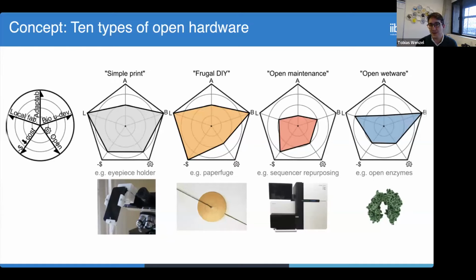And I don't know, maybe in other places you don't have these electricity spikes, but you might not consider that in your design, or we have earthquakes, so things fall down. So let's just say you make a design and then we want to use it, but really we need to make some modifications to it so that it works well for us. So how adaptable is the design? I think that's an important category.